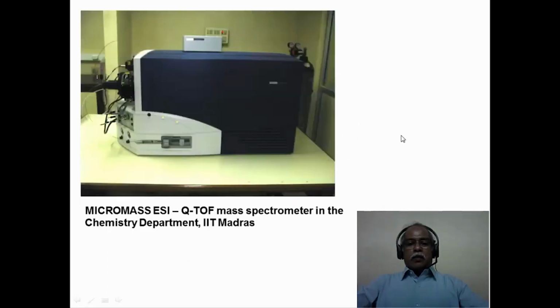Now, here is an electrospray ionization mass spectrometer housed in the Department of Chemistry at IIT Madras.